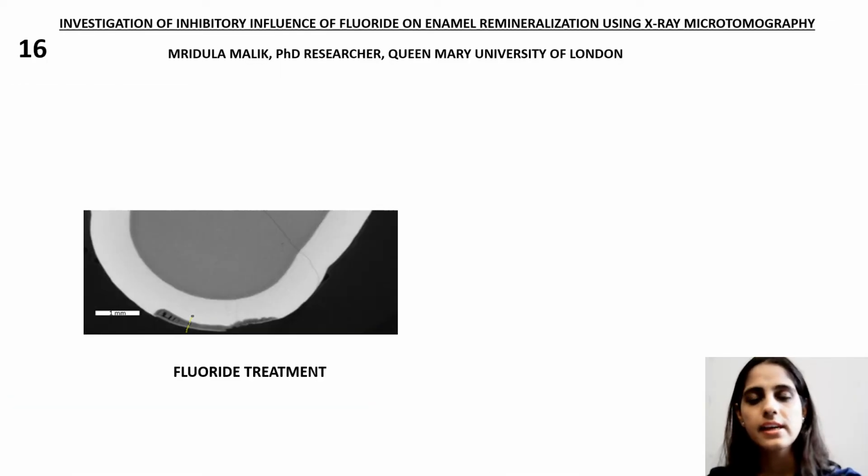Hi everyone, today I will be discussing in brief the effects of fluoride on enamel remineralization through X-ray microtomography. In order to achieve this experiment, one half of the sample was first subjected to 4 days of demineralization followed by a week of fluoride treatment. It was then immersed in artificial saliva at pH 7 for about 56 days.